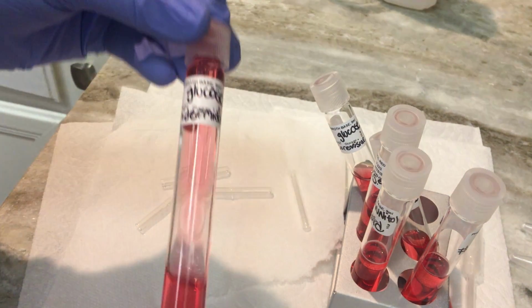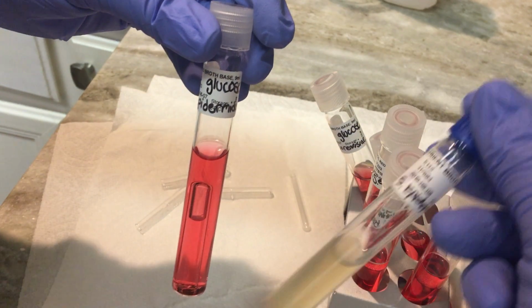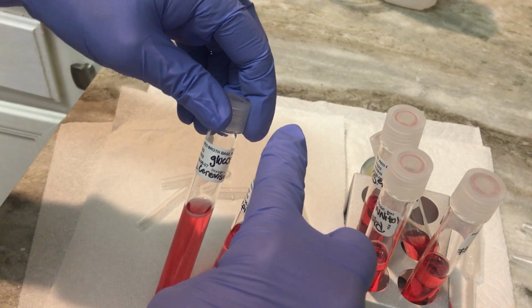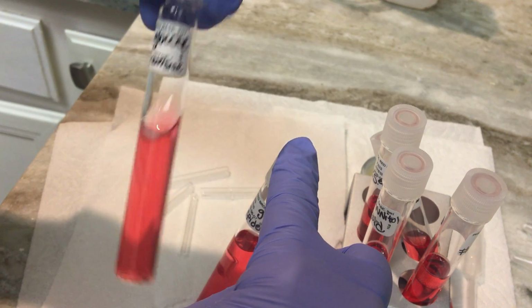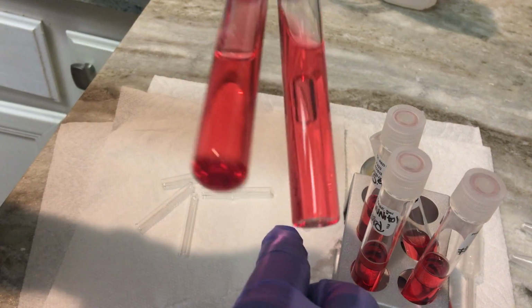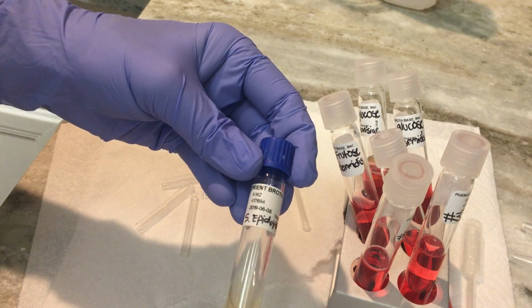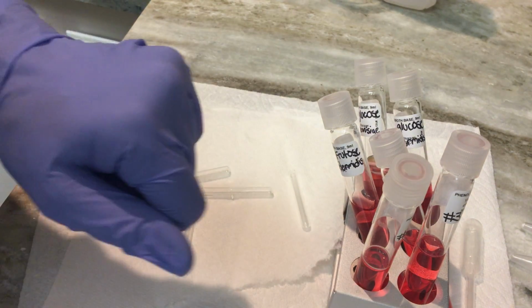So after we're done doing that to all 6 of them, I have my broths set aside here, and for each one of these, as you know, there's glucose, but here's glucose, and one is S. cerevisiae, and the other one is S. epidermidis, right? So each one of these are going to have their own broth in there. We're going to do about 4 drops of broth there, and then we're going to let them sit there and incubate for 12 hours, and then I'll get back to you with the results.